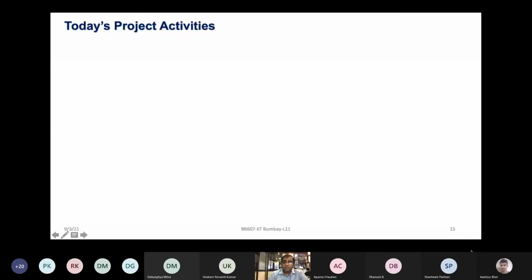All right. Well, thanks, Sushmita and Meher, for showing you the steps. I hope all of you got the visual feel of how to do these experiments in the lab, which is not very difficult. You just have to add the reductant, alkylating agent and enzyme, and ensure that in the process everything is maintained at the right temperature and with the right timing for incubation. If you do all that well, then I think you can get good digested peptides from the protein. So that's all for the sample prep activities.